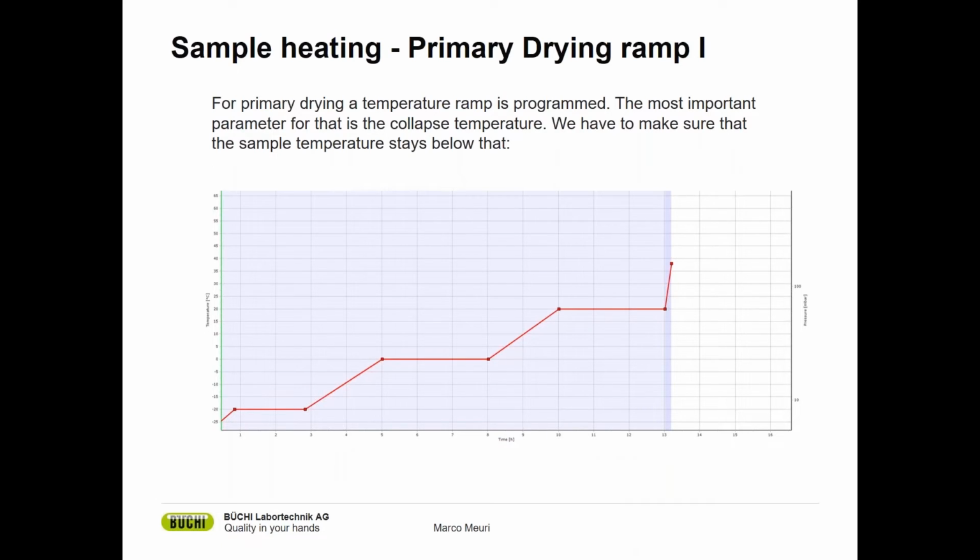So now if we use heatable shelves, what we will do in the freeze drying step, or as it is called, the primary drying, is apply energy to the frozen sample. So we take the frozen sample out of the freezer together with the shelf. It's very important that the shelf goes into the freezer as well. We will apply energy and we will make sure with the sample temperature probe that we do not reach the so-called collapse temperature.